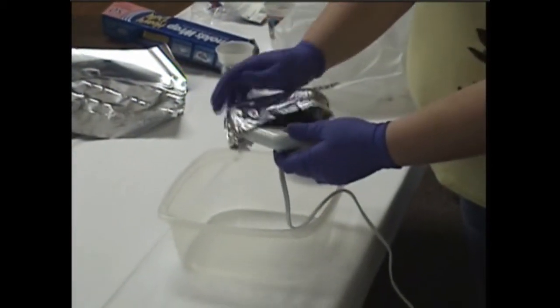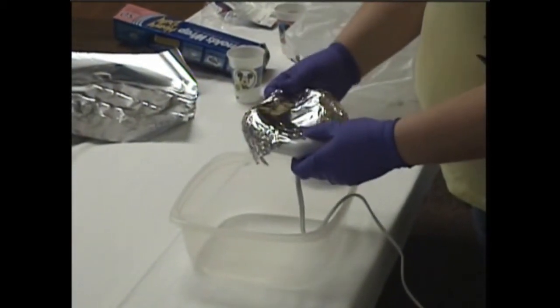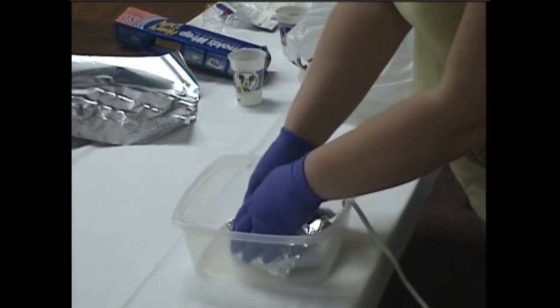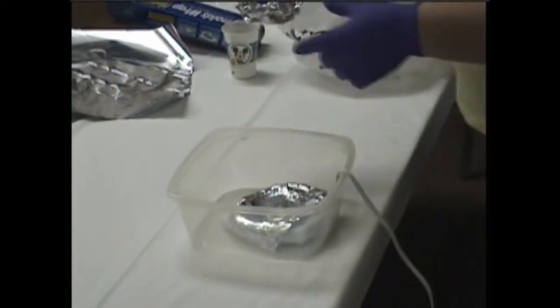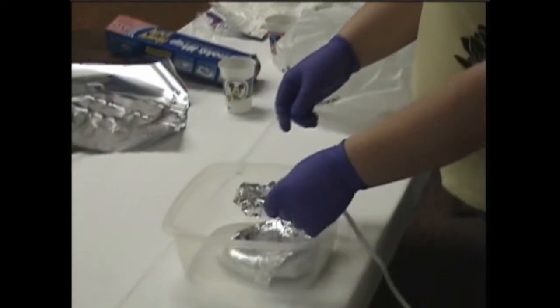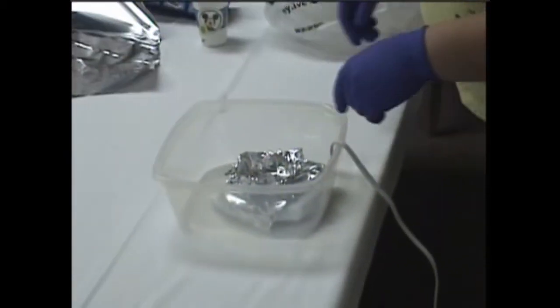You put foil over the candle warmer. Then you need a container to put the superglue in. I just made one out of aluminum foil.